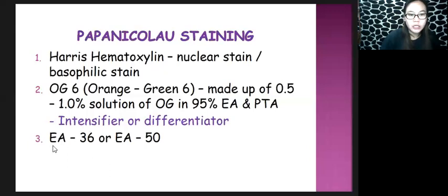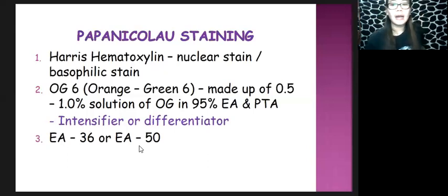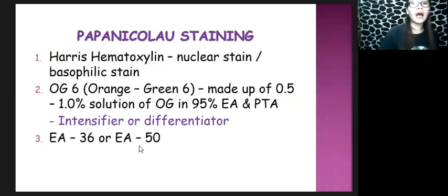The components of your Eosin Azure: we have light green SF, Bismarck brown, Eosin Y, phosphotungstic acid, and lithium carbonate.